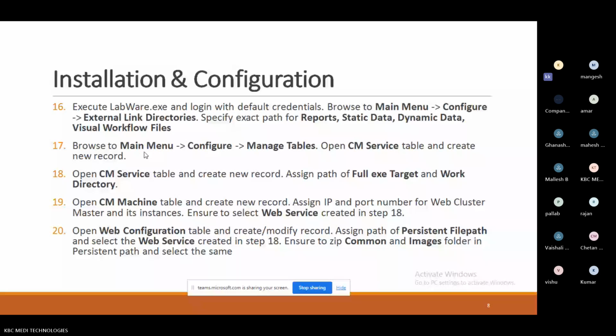So when we have such a type of procedure, how to make user roles first, after creation of user roles, how to make the provisions, followed by we need to create the user IDs, followed by we need to do the configuration in the system. So when I log in as a user, how should the system work.